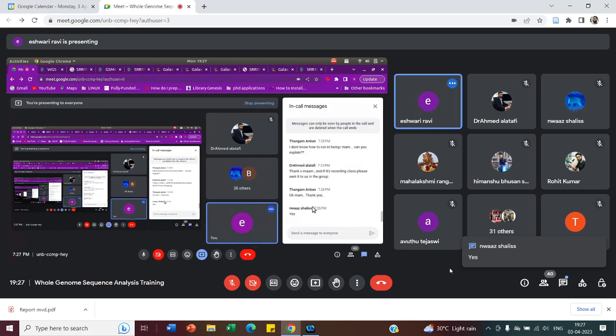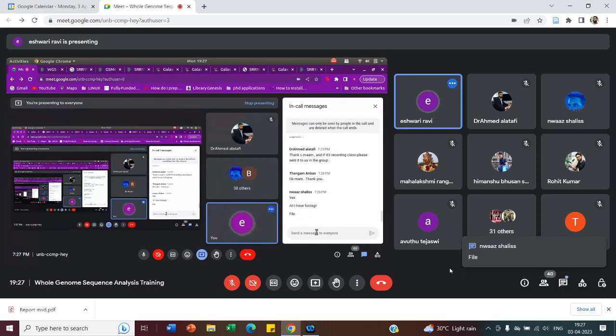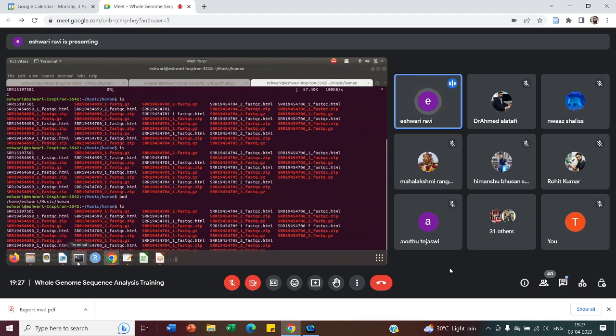Conversion of a FASTA file to a FastQ file will actually lead you to false FastQ quality scores. You will actually have a FastQ file itself once you are sequencing. It's better to have a FastQ file because they have quality scores. I can show an example of a FastQ file and why we use FastQ files for the analysis.